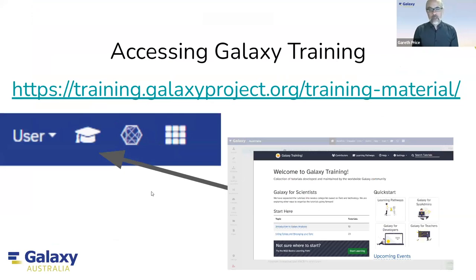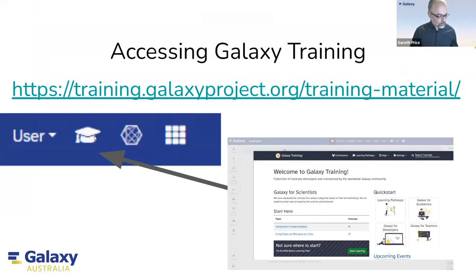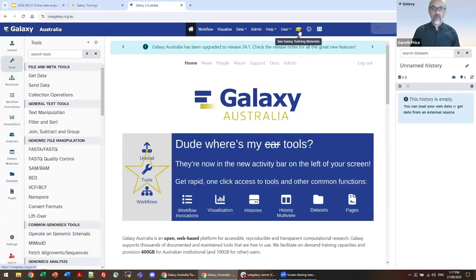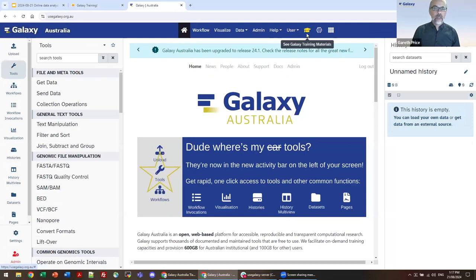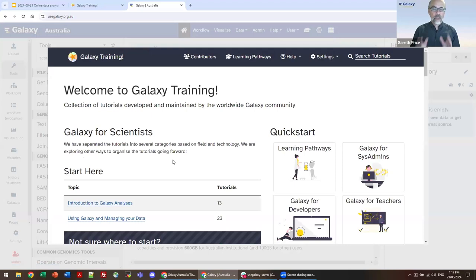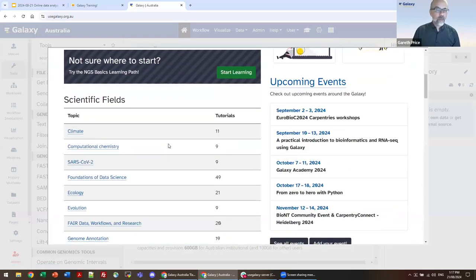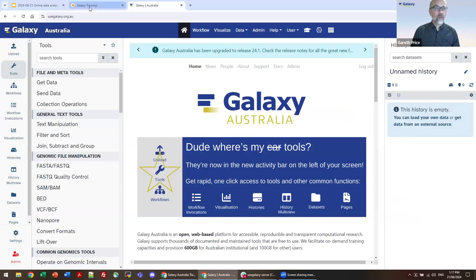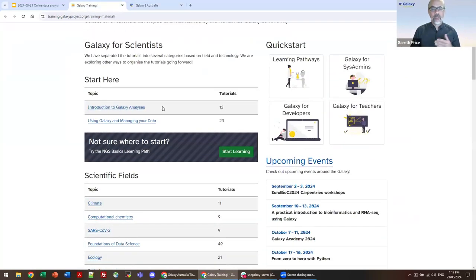I wanted to highlight that we will be accessing Galaxy Training today. There are multiple ways to do this within Galaxy. When you go back to Galaxy Australia you'll see a little academic hat icon — that brings up Galaxy Training as a pop-up window in the middle of your screen. You can also open it as an individual tab in whatever browser you have. This is a great function because it means when you're learning you're not leaving Galaxy. I will be operating out of a separate tab today because it makes it easier for everyone to see where I'm up to.